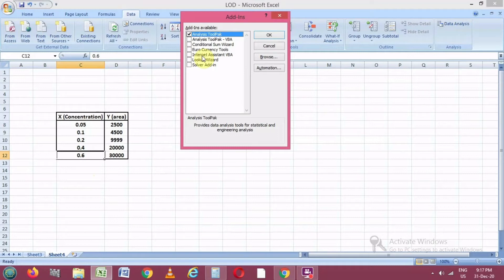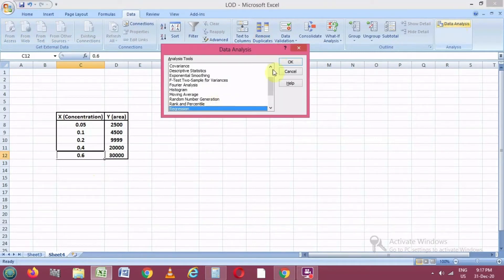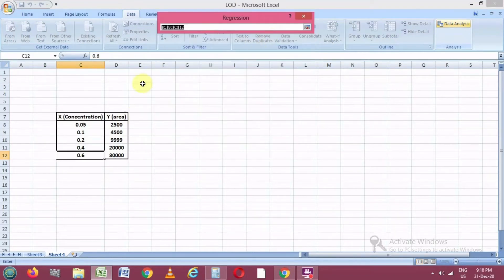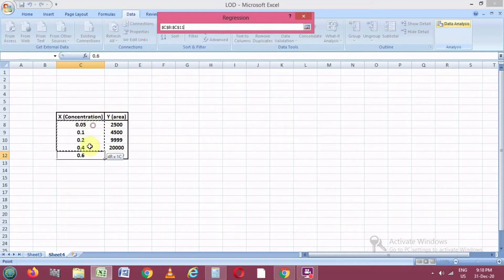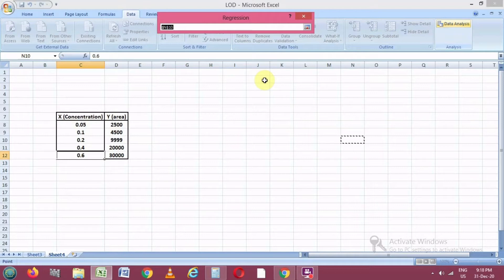We have copied the X and Y values from the first sheet. To enable the Data Analysis tool, go to the File section and click on Excel Options, then click on Add-ins. Click Go, check the Analysis ToolPak, and click OK. After this, you can go to the Data section and confirm that Data Analysis mode is enabled.